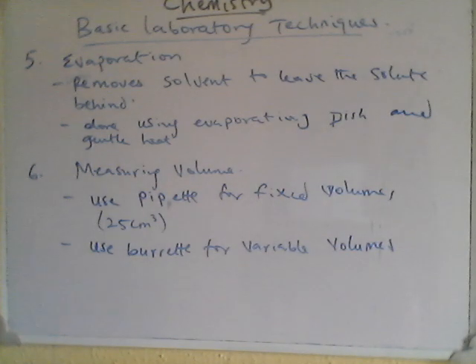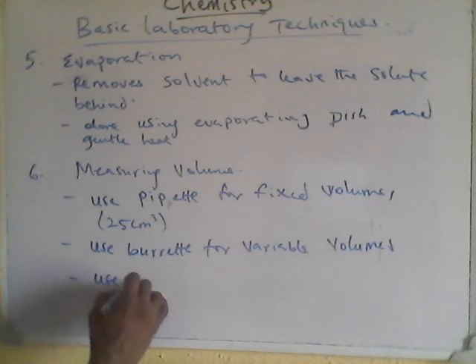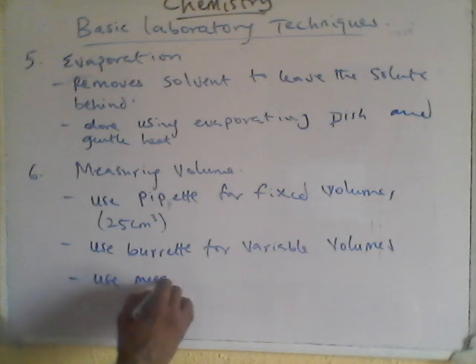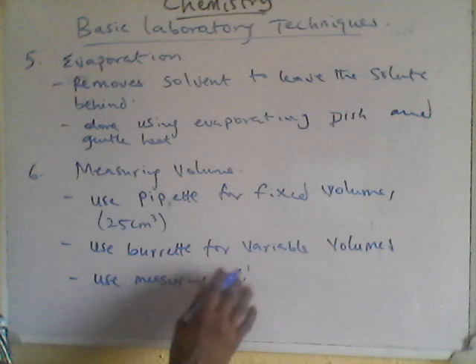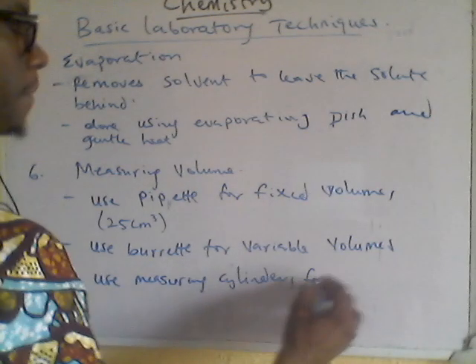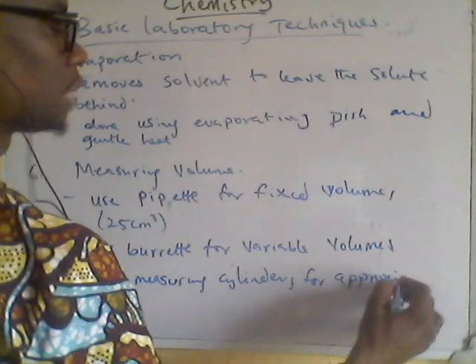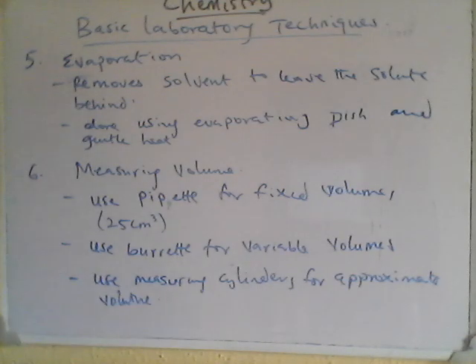The measuring cylinders are for approximate volumes. So we can use measuring cylinders for approximate volume. These are the common techniques that we use in the lab. So we'll go on to laboratory safety rules.